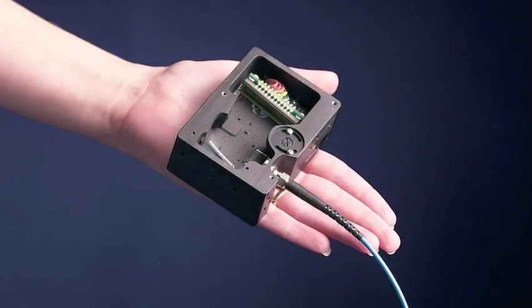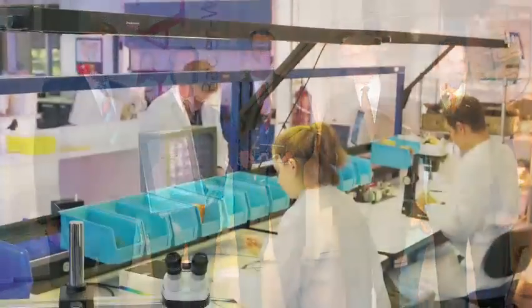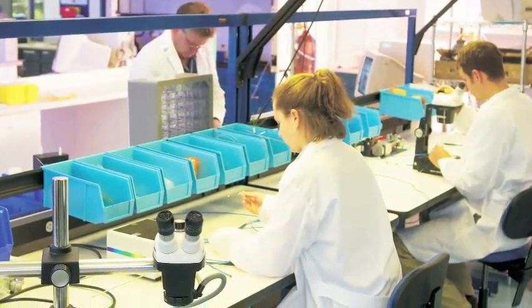As the creator of the world's first miniature spectrometer, 20 years of experience has made OceanOptics a unique and vertically integrated manufacturer.